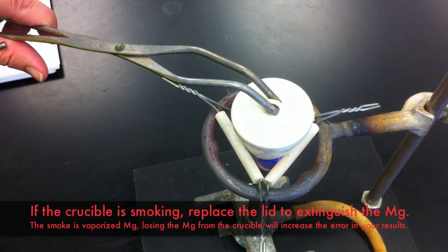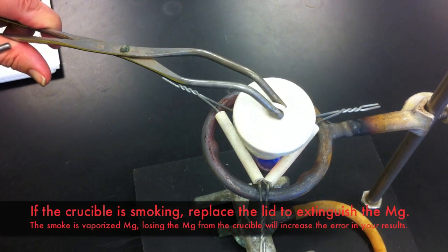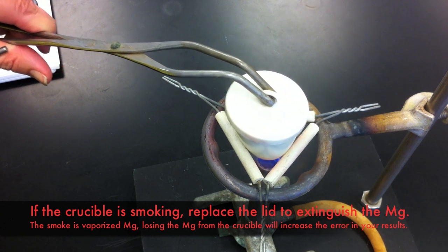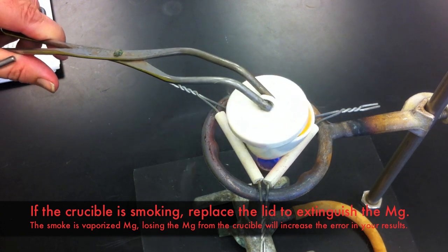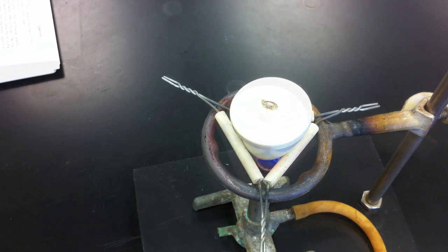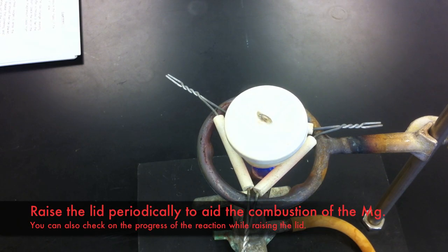During this reaction, you will want to ensure that oxygen gets in for the reaction to take place. You can either do this by tilting the lid off the crucible slightly to allow oxygen flow, or raising and lowering the lid periodically. Be sure not to let the reaction smoke too much. Any smoke coming out of the system is actually a loss of product.